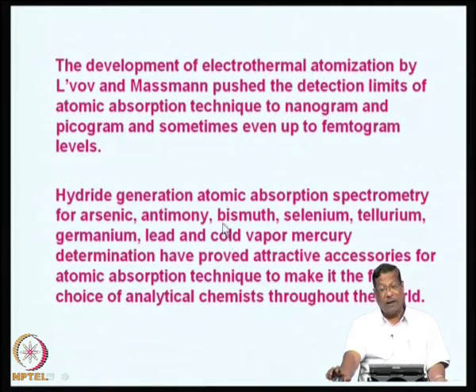And other accessories for atomic absorption which have developed over the years include hydride generation.